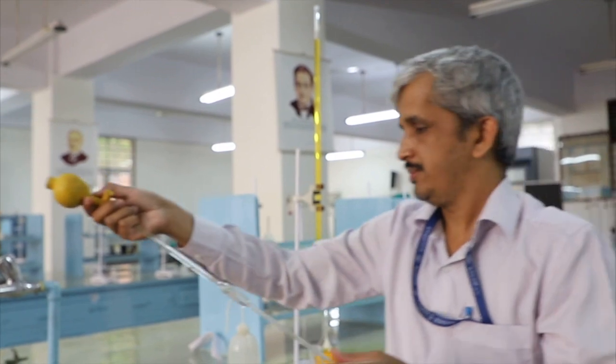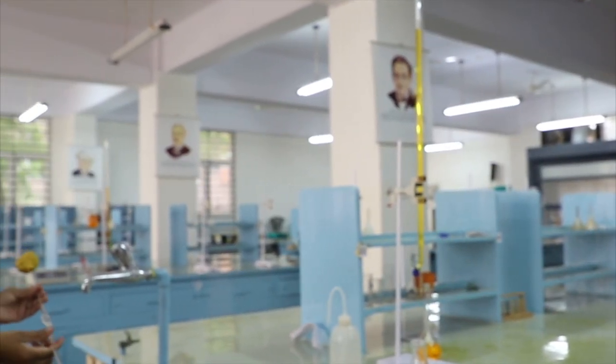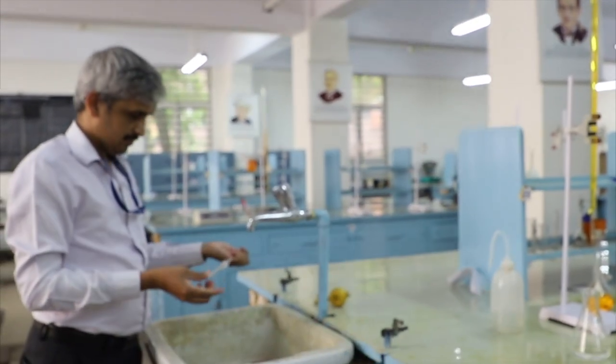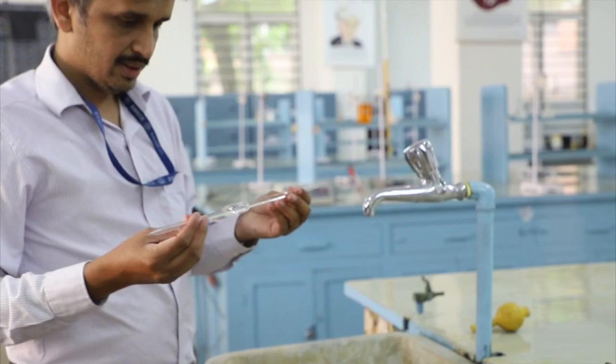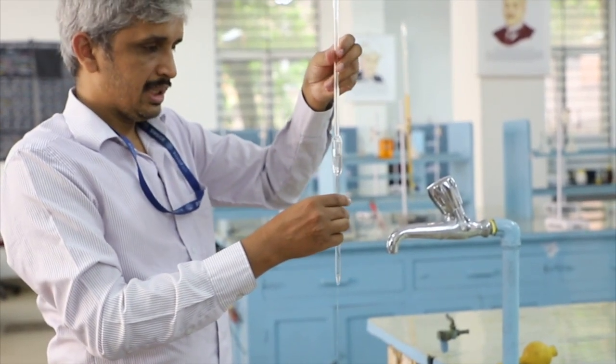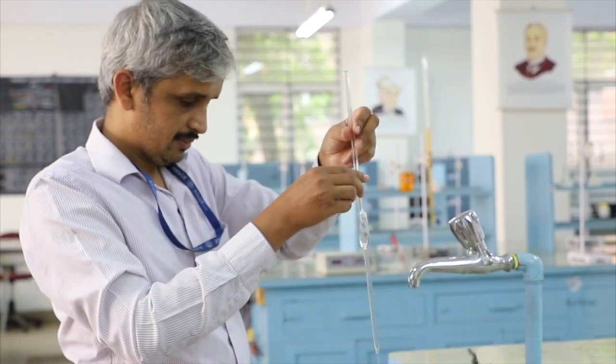Then remove this. So all the region inside the pipette is completely rinsed with the distilled water.